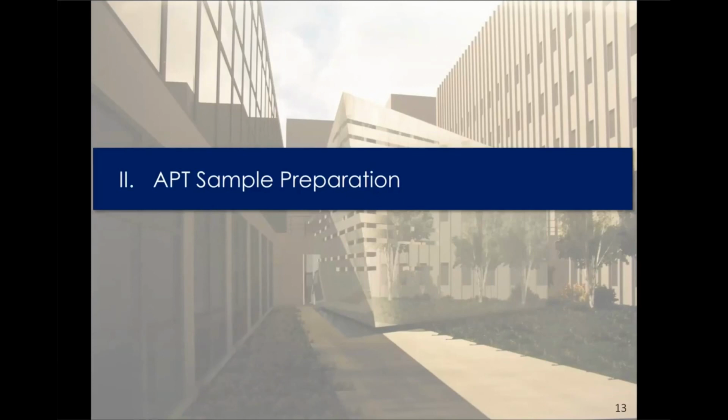And it's actually quite an important thing to talk about with atom probe, because atom probe has very unique requirements for samples. And because of that, the sample preparation step can often be the crux of the whole experiment. When it comes to saying what is an achievable atom probe data set, what can you get easily, what is almost impossible, that can oftentimes be limited purely by how you can actually prepare your sample.